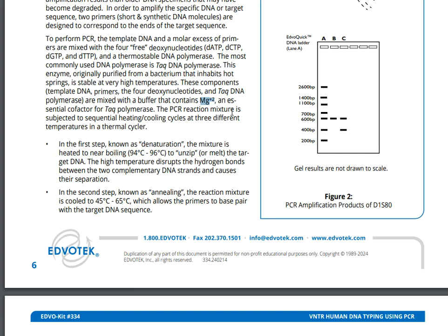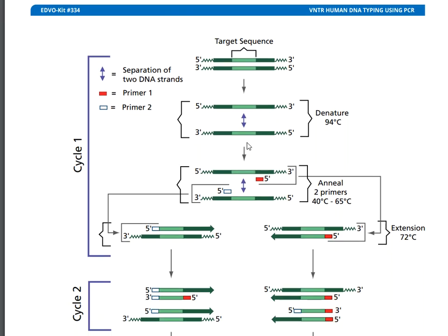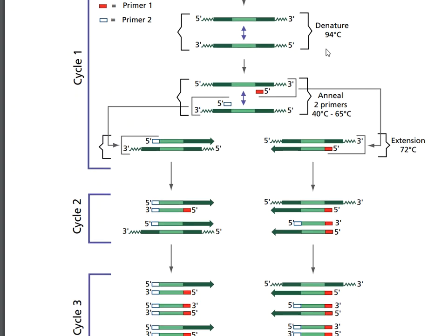So like we've discussed before, a lot of this stuff is repeat from prior videos. We're going to have 3 stages of a PCR. So what will happen is that here we get some DNA strands. This is double-stranded, and we need to heat this DNA up to 94 degrees. So this is going to separate our DNA strands from each other. So we have one strand up here at the top, and we have an anti-parallel strand that runs here at the bottom. So at 94 degrees, that's when that happens. It just needs a little bit of heat, and that is it.